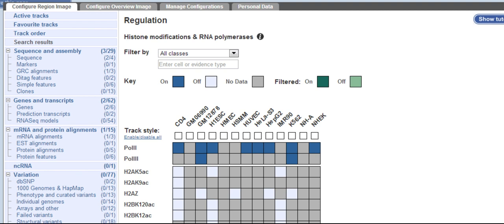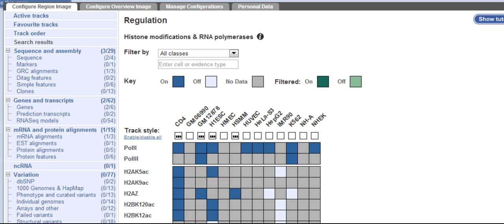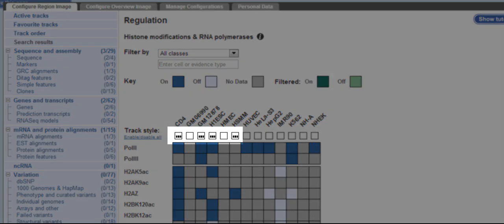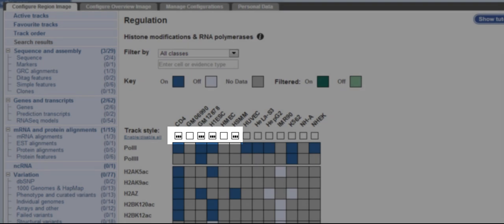You can drag and select boxes on most updated browsers, but this won't work on Internet Explorer 8 or below. I'm using Chrome, so it will work. This turns on a region of the matrix. Notice that if I do turn on some histone modifications, the corresponding cell type is automatically selected.